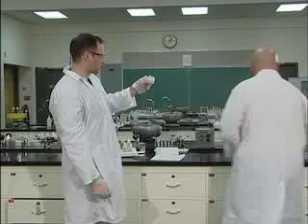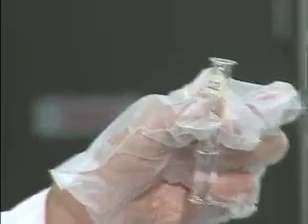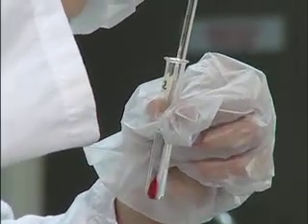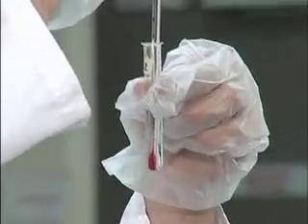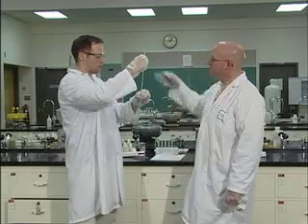So we're going to measure our temperature again. I didn't clean this off. It won't matter too much, right? Not for this one. This one will be okay. And again, we will notice probably just a slight temperature change. This one's gone up just a little bit, probably about 2 or 3 degrees. So there's a slight temperature change again.